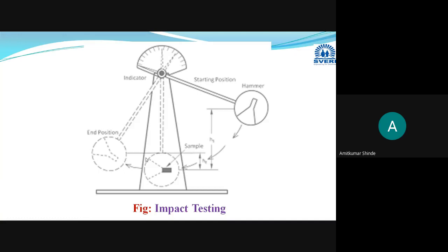Then after this, the next test is the tensile impact energy testing. I have not collected a separate diagram here for it. Now here, only a small change will be there. Okay, which small change are we making here?